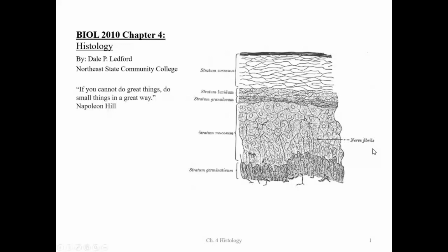Welcome to Lab 1. This is our histology lab. This is our very first lab that we do. In this lab, we're going to be looking at tissues. I have to do this in a slightly different way. I'm doing it in a classroom, so if the audio sounds different, just let me know.